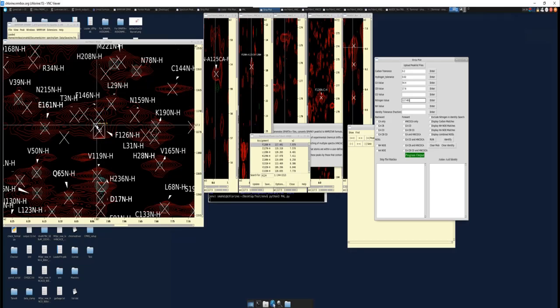So this works well. This is one advantage this technique has over Sparky. You will not get peaks from poor resolution or slightly overlapping residues, because those peaks will have distinct nitrogen values, right? Sparky will give you matches even if you have poor resolution or overlapping residues, so you can actually get more matches than you would normally want. So it's just a different way of doing things. Make sure you just click enter on all of them.